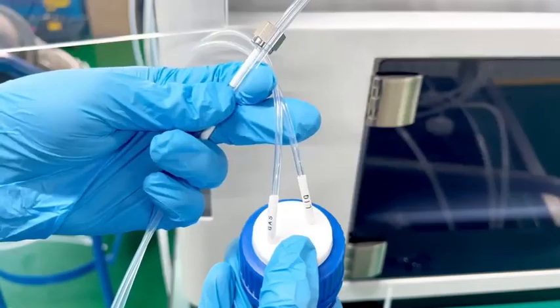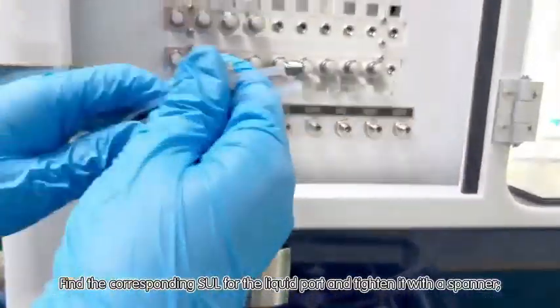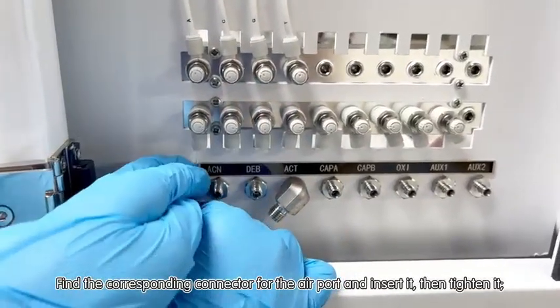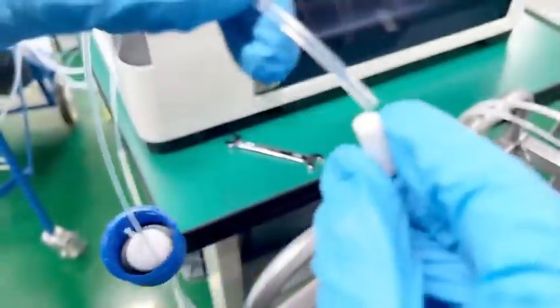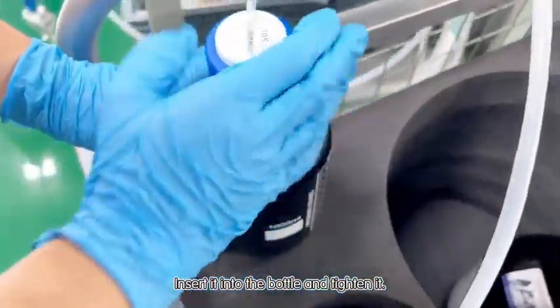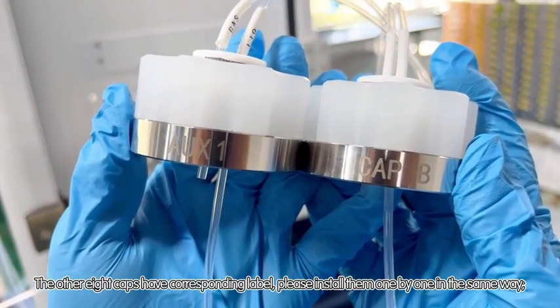Step three: Find the corresponding sole and insert it through the port. Find the corresponding sole for the liquid port and tighten it with the spanner. Find the corresponding connector for the air port, insert it, then tighten it. Add a filter to the other end of the tube, insert it into the bottle and tighten it. The other eight caps have corresponding labels — please install them one by one in the same way.